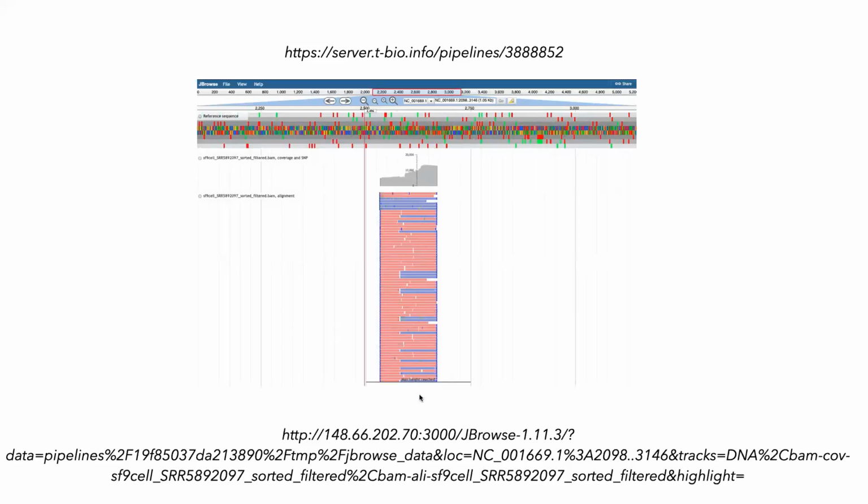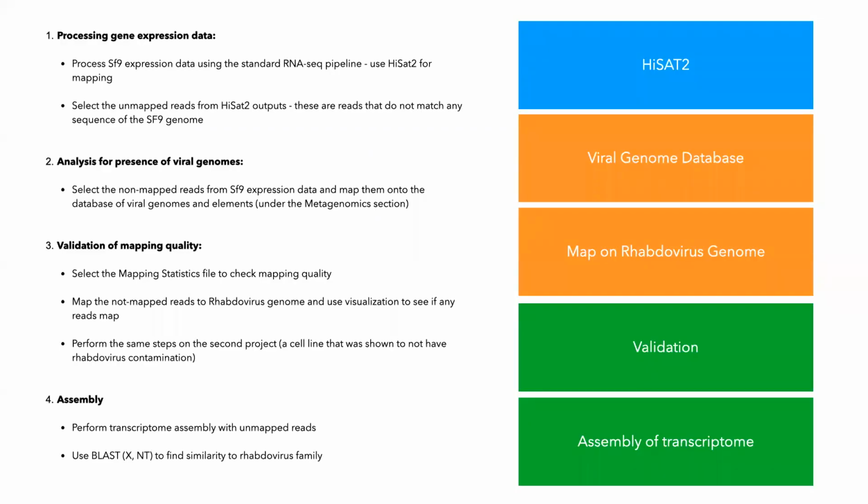And the problem is that this virus is obviously a genome close to 5,000 nucleotides long, and here we can see a very small portion stacked up together. This typically represents some kind of technical issue when reads are nicely stacked up, just like what you're seeing here, and not spread over a wider portion, which would mean actual biological presence of that organism in a sample.